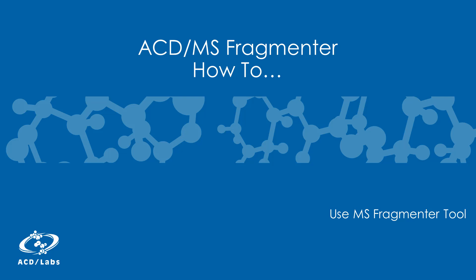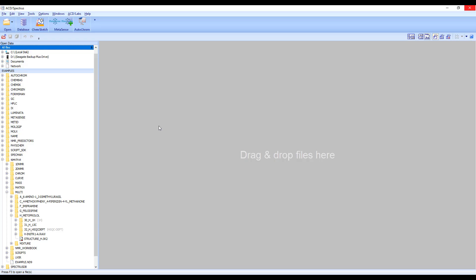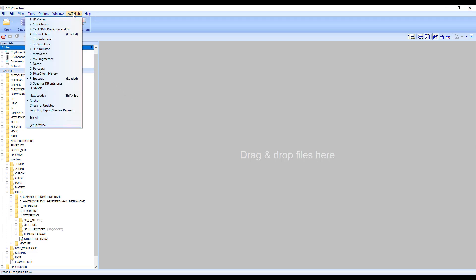This video will show you how to use the ACD Labs MS Fragmenter tool. You can launch the MS Fragmenter tool from your start menu or from Spectres Processor by going to the ACD Labs menu and selecting MS Fragmenter.